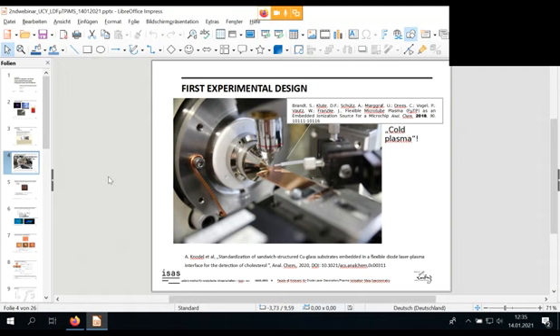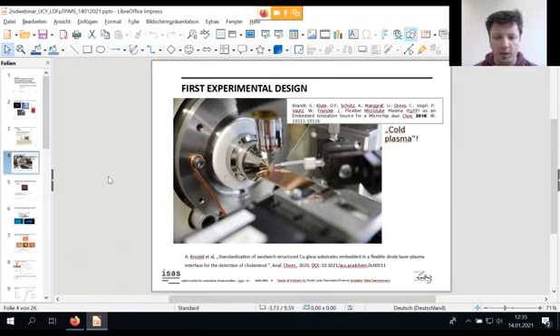Have you ever tried to change the distance between the sample and the lens? Yeah, that's something you regularly do when aligning the substrate. You get into the center of a cavity, you align the depth or length of focus to the surface, and you basically use the focus.